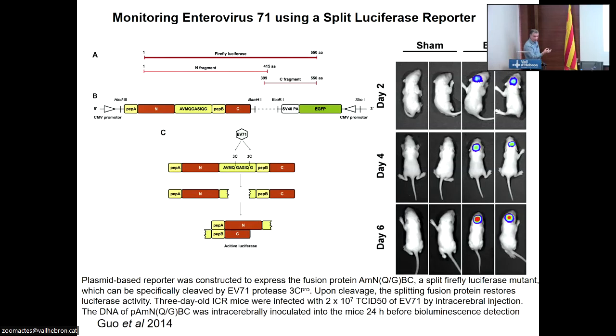So again, the advantage of this is that if you've got a lot of environmental viruses, patients coming in, and you want to be able to test it and see, is your drug specific against that? Just like with SARS-CoV-2, it kept evolving from the alpha to the delta to the Omicron variant, kept evolving all the time. You don't want to keep re-engineering the virus. What you can do is circumvent that by using an animal model such as this.